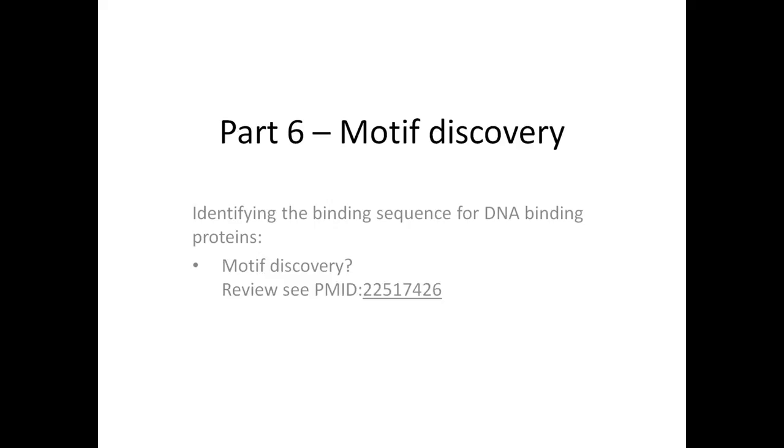I'm going to describe one of the many ways of running a motif discovery analysis. The main aim of this type of analysis is to identify a short sequence, also called a motif, of about 6 to 10 nucleotides to which the protein of interest is binding. Therefore, motif discovery is applicable to DNA binding proteins such as transcription factors.